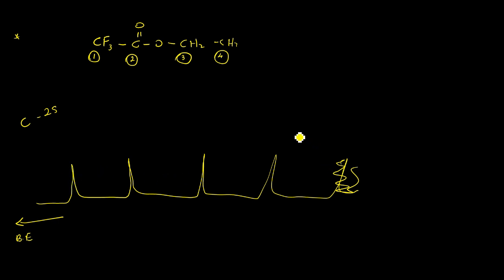What you need to think about is the environment, right? As you can see, look at this carbon number 1. It's surrounded with fluorine atoms. Fluorine is very electronegative and will pull electrons out from the carbon, which makes the carbon relatively positive, right? So when electrons are emitting from your carbon, this small positive charge will create an extra attraction to your electrons.